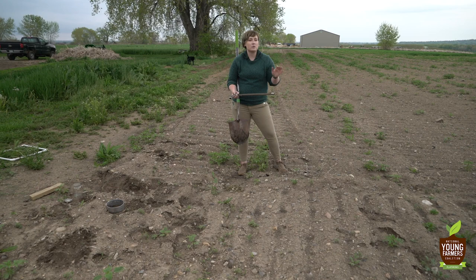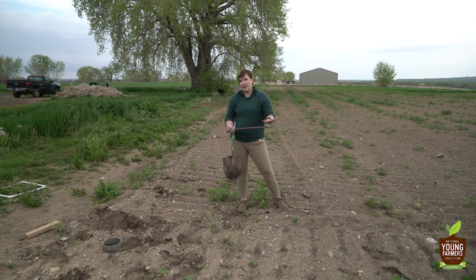I don't try to do this if you've got clay soils that are really, really dried out. You're not gonna have good results. Your soil test results are only as good as your soil sample collection.